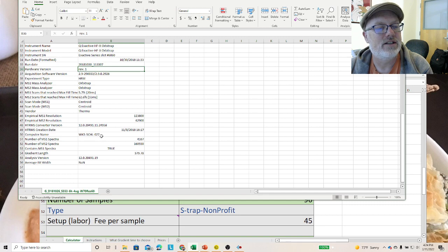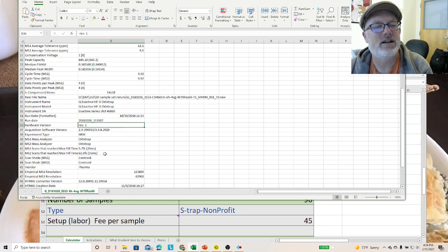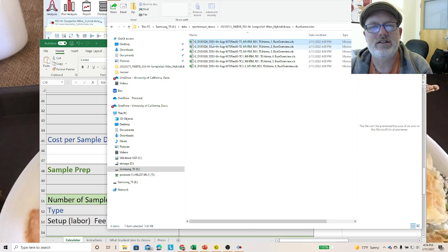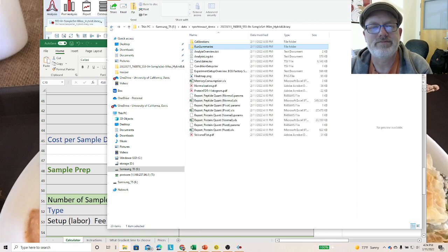It even gives you, I think, the serial number of the instrument that it was run on somewhere. Anyway, that's what those are, and there should be one for every single run in the experiment. There were 6, so this was a 3 versus 3.